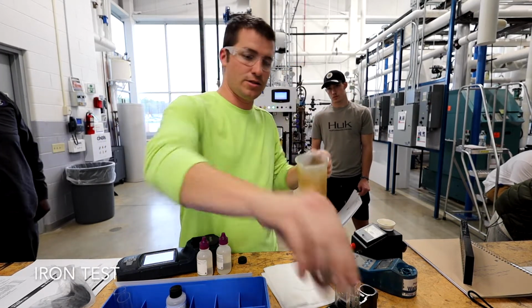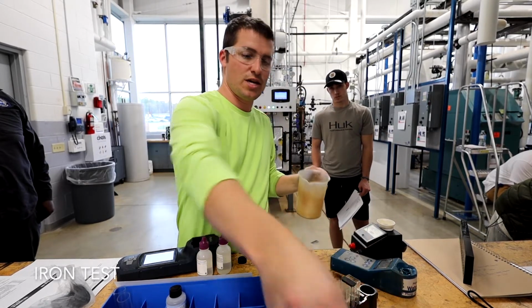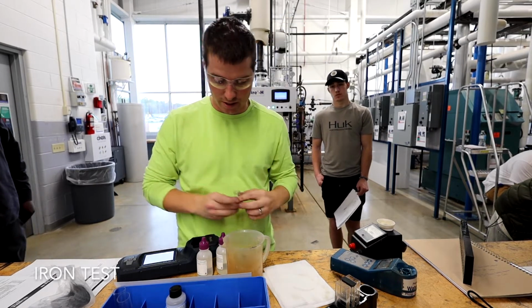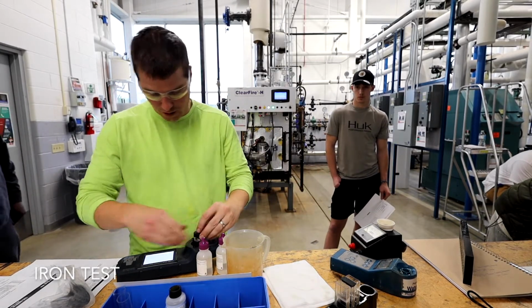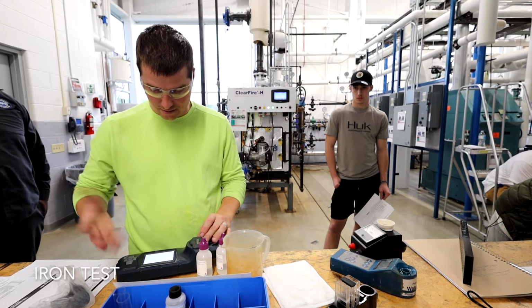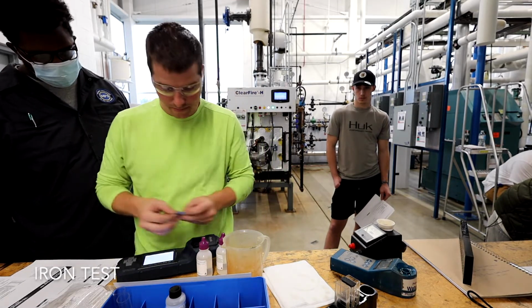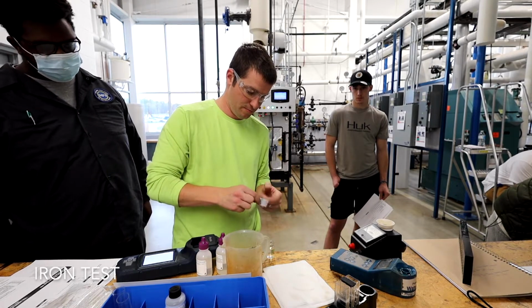All right, so I'm going to rinse this out. Make sure that I don't have any contamination from whatever I was testing up the charter. Okay, for this one I fill to the 10 milliliter line. All right, I put it in my fancy meter. I choose an iron test. I zero the meter out with what we call the blank. And then I go ahead and add an iron packet to it. And if there's any iron, it's going to turn orange.